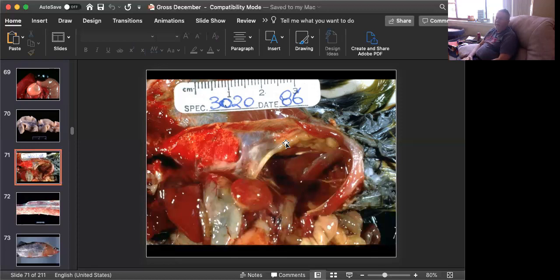The other thing is you're going to see, both within the spleen and within the liver, cells, in this case large groups of cells, which contain chlamydial intracytoplasmic inclusions. If you've got a great slide, you're going to see them as little tiny purple dots within degenerating cells. And you'll see them here in the spleen. You'll see them in the liver. The liver has been pushed out of the way. Looks like it's up here. I just didn't want to comment on that. But those are two great morphologic lesions in psittacosis in psittacines.